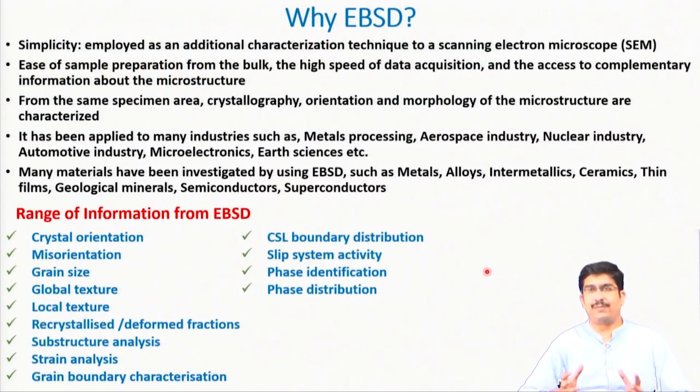Okay. So why EBSD? First and foremost is simplicity. It's a very simple technique, yet a high-end characterization technique, and over my entire research career I have realized that if it is used by someone who has very good knowledge of characterization techniques and material science, they can do wonders with this. It can compete very well with other high-end characterization techniques like electron diffraction, transmission electron microscopy or X-ray diffraction. It is a very powerful technique, but it is a very simple technique as well.